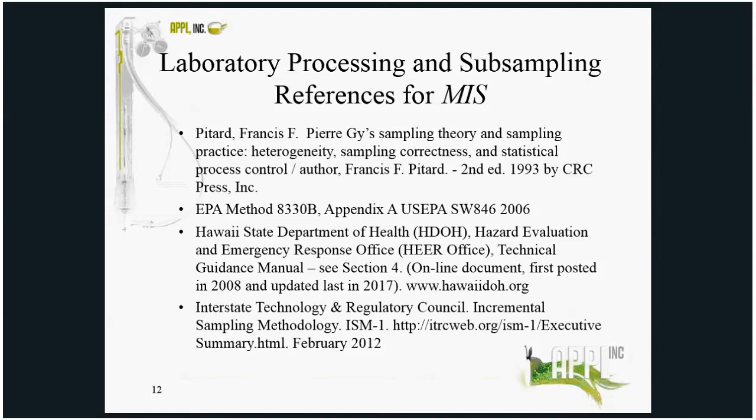And there are detailed methods for field collection and/or field processing of MI samples that can be found in the HEER Office Technical Guidance Manual that John mentioned, in sections 3, 4, and 5. And section 4 of that same guidance addresses lab processing issues for MI samples.